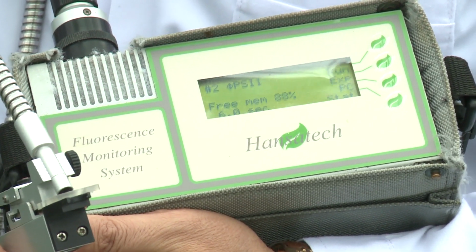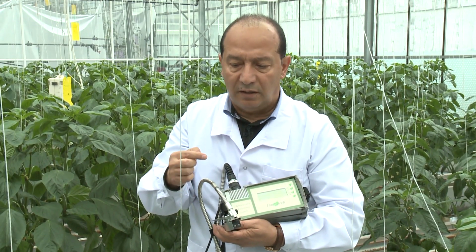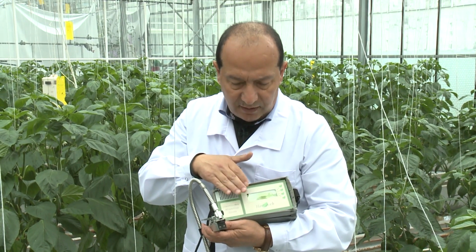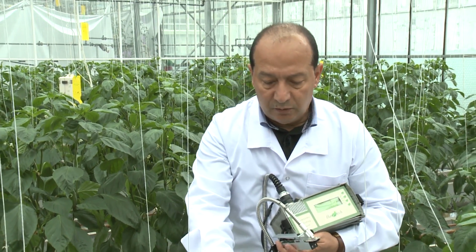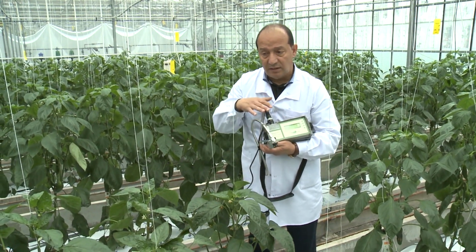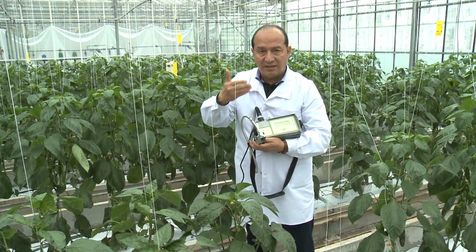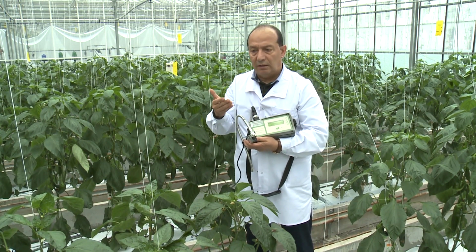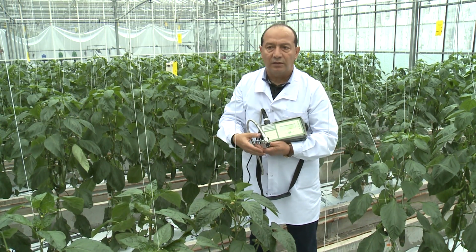So any values below these values, as we mentioned, mean that the physiological status of our plants is affected by some type of stressor. And as I said before, we can see this decrease in the value, which can indicate something is happening with our plants, but we still cannot see it with our naked eyes. So this is the only method for early stress detection, no matter whether it is nutrient deficiency or water deficiency as well, or any other type of stressor.